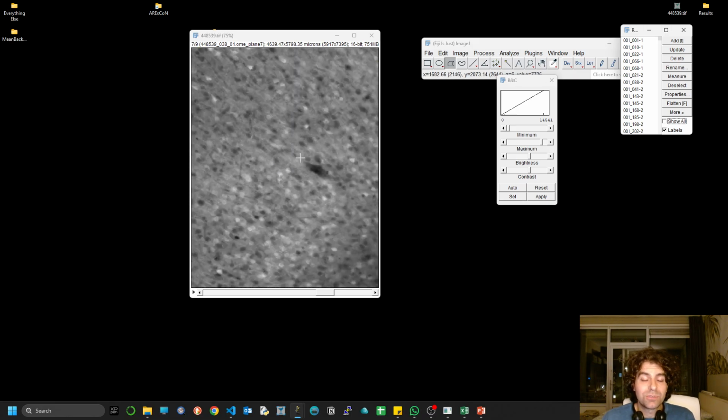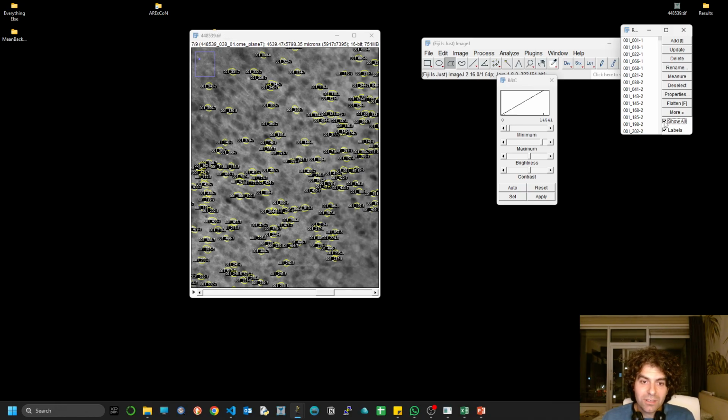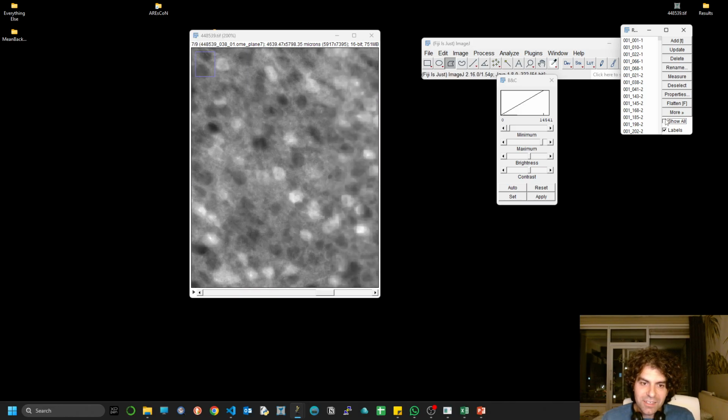This is all up to you, really. And let's look at some other images as well, originating from 7 and 8. Indeed, let's find an 8. For instance, this says it's 8. So let's go to 8.